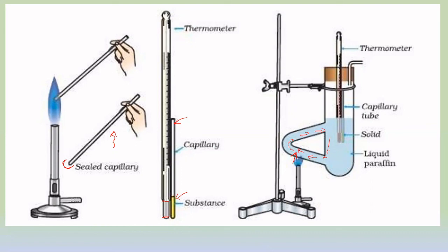Okay, everyone knows how to take the melting point: the point at which that solid will turn to a transparent liquid. As you are taking the melting point, you will find first a small amount of solid becomes liquid. As it becomes a liquid, stop heating, because you have already provided some amount of heat. By the time it reaches the test tube, it is going to melt completely. So now you completely observe that compound.